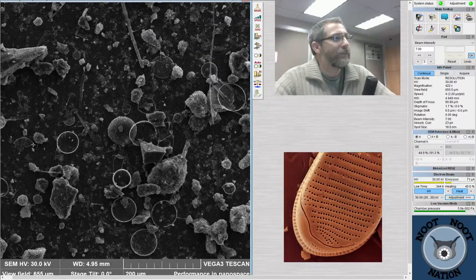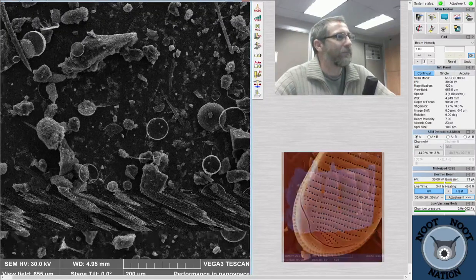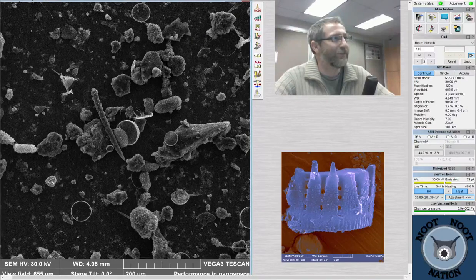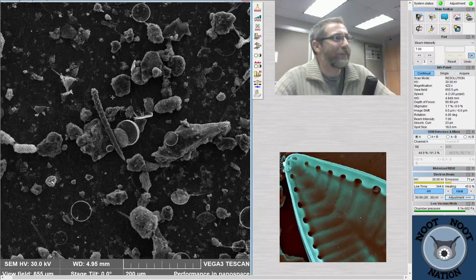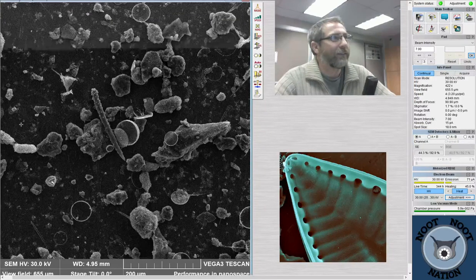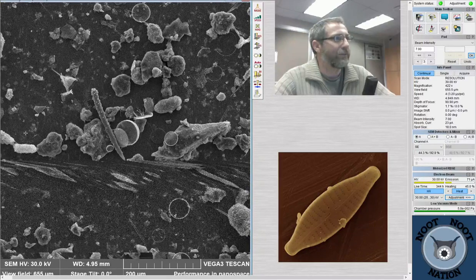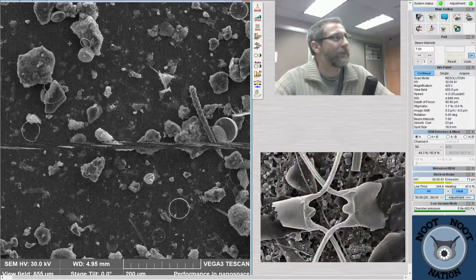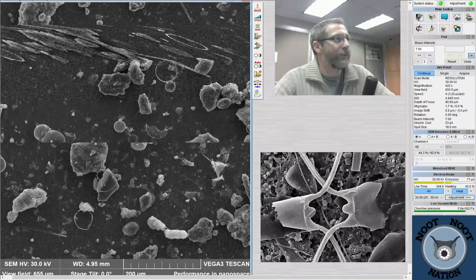I don't remember exactly when this sample was collected. I think it has a date on it, but I didn't write the date down. I just called it San Francisco Bay Number 7 because it's the seventh sample that we've gotten from Pacific Plankton. And it's a sponge spicule. We see other things besides diatoms in the samples, of course. These samples were collected with a plankton net from a pier out by the San Francisco Bay Bridge by Pacific Plankton.